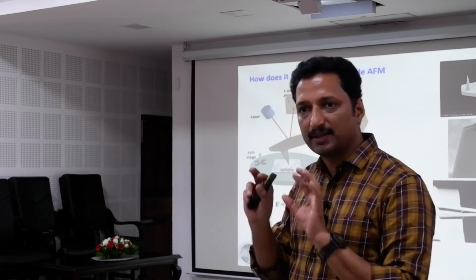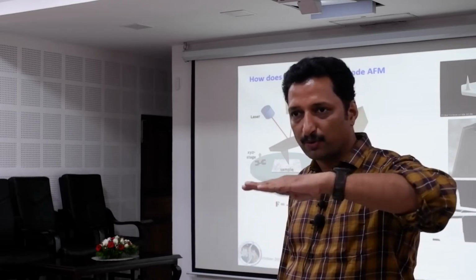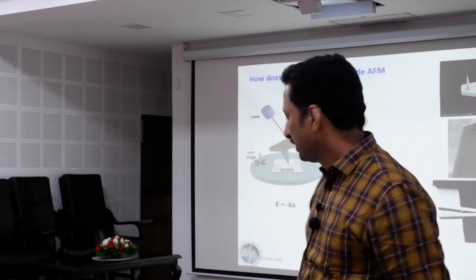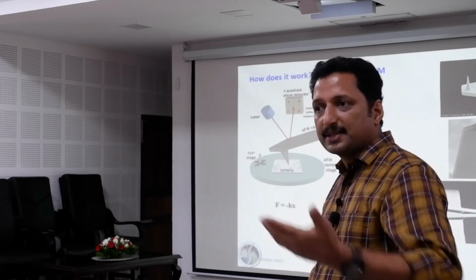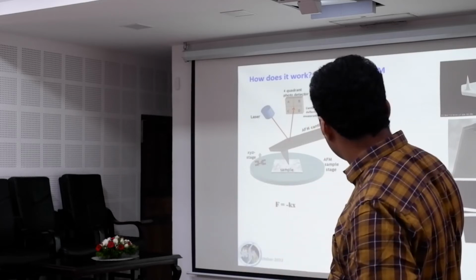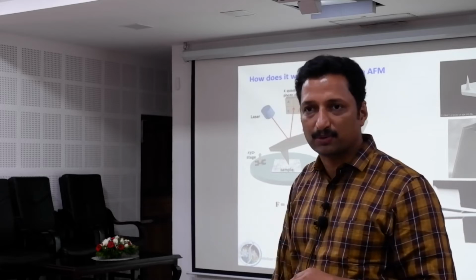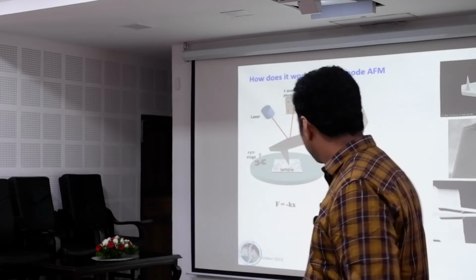It is already designed and fabricated, so it won't wobble like this. It will move only like this. It is very stiff in this direction. And if you want to increase that stiffness in other directions, you can actually use this geometry. This will not be wobbling again, but that is a more costly type of tip.